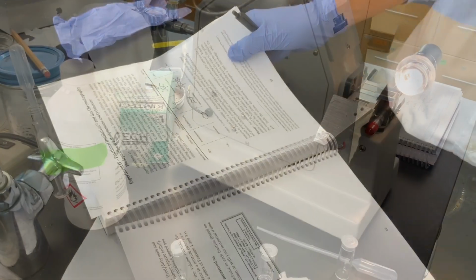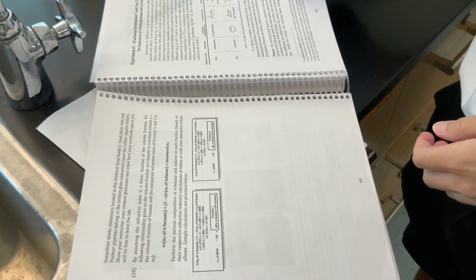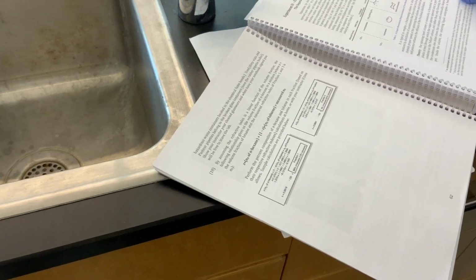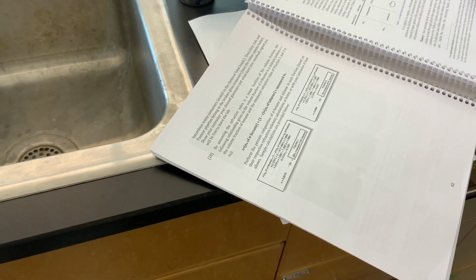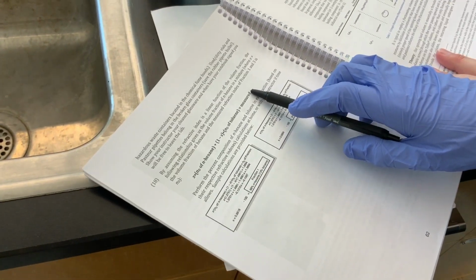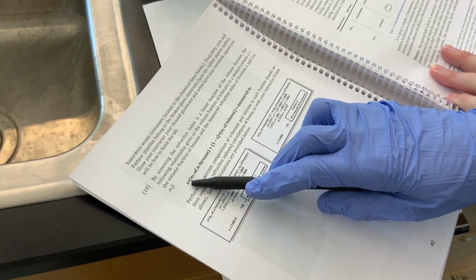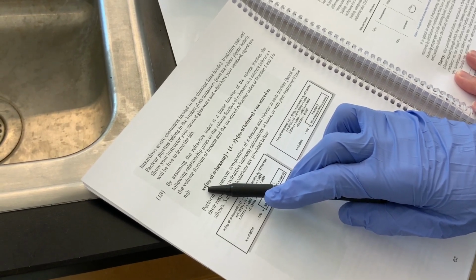All right, we're done. So now we're going to use the refractive indices. We're going to use these data in order to calculate the percent composition of each fraction. And so we're assuming that the refractive index is a linear function of the volume fraction. And so this is the following relationship, which gives us the volume fraction of hexane in a mixture, where X is equal to the volume fraction of hexane and the measured refractive index.